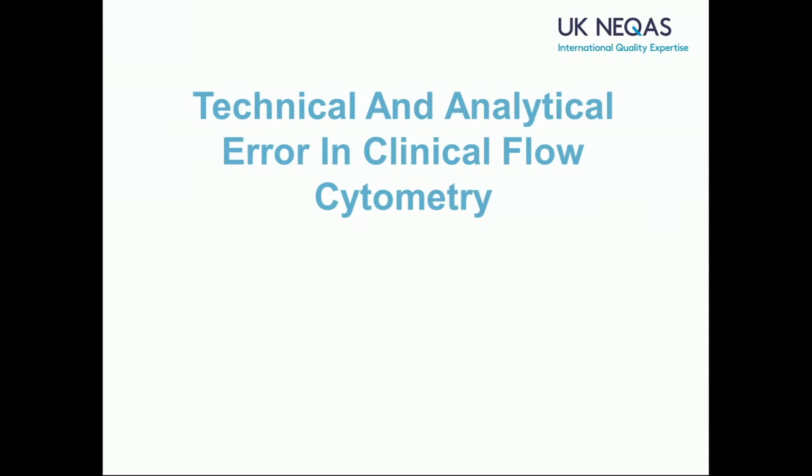And we've also got another digital morphology program. It's quite a long name, Haemato-Oncology Bone Marrow Aspirate Assessment Program, but it's intended for people looking at bone marrows. So if you've got clinicians or scientists looking at bone marrows on a regular basis, we've now got an EQA program for that.